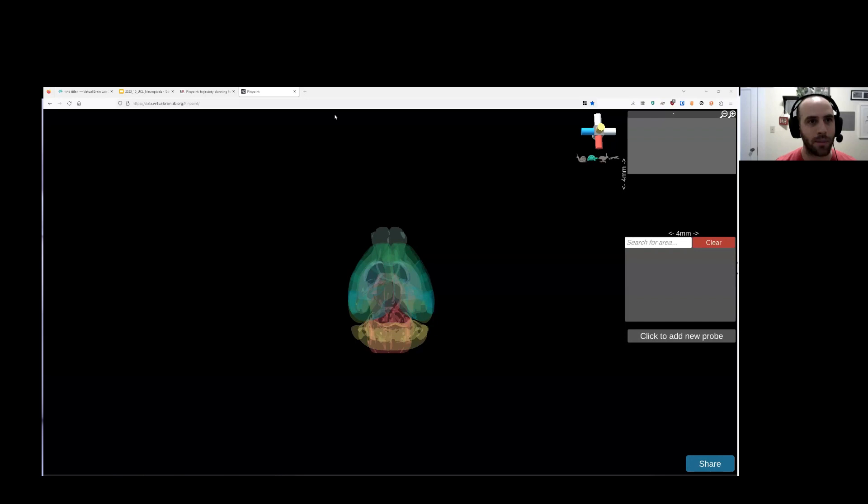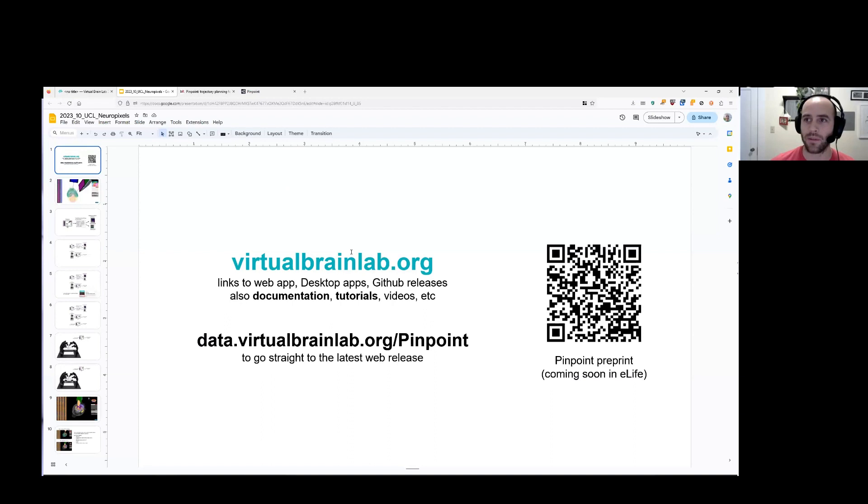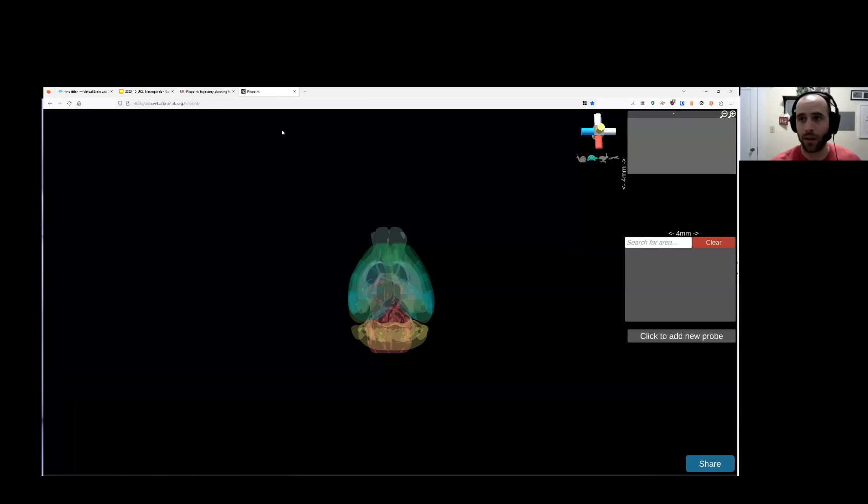It works as a desktop application. It works in your web browser. So here I've loaded up the website, and I'll just flash the links for a second. So virtualbrainlab.org is where we have documentation and tutorials. This link here goes to the actual web app. And then we have a Pinpoint you can read more about Pinpoint in if you want to. But right now, let me just introduce the whole thing to you quickly.